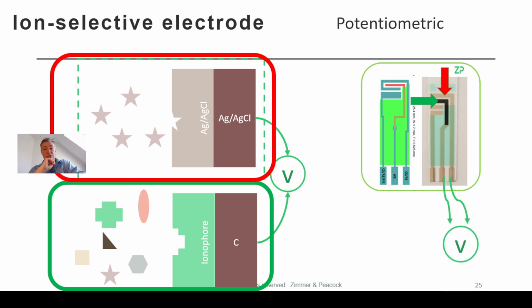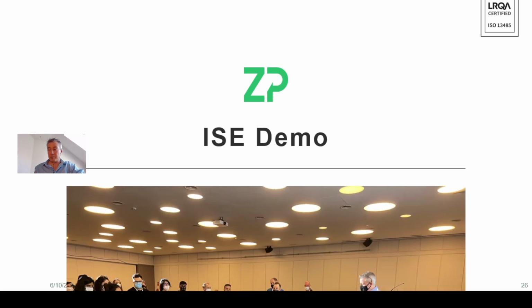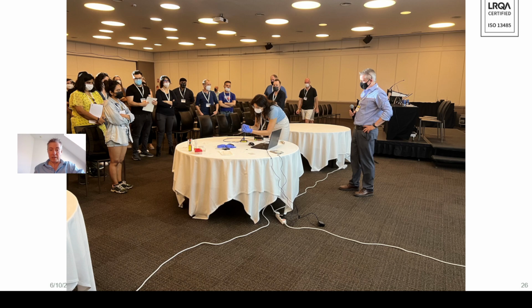Now, as I said, when we first gave this webinar, we don't just make people sit there, we actually get them up, and here you can see an image of one of our engineers called Siobhan doing a demonstration for the attendees on ion-selective electrodes.